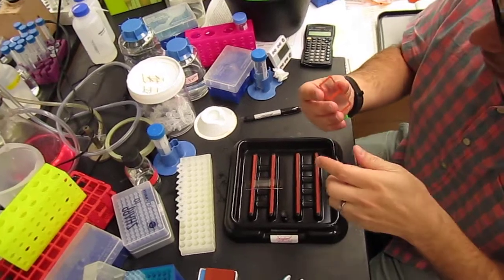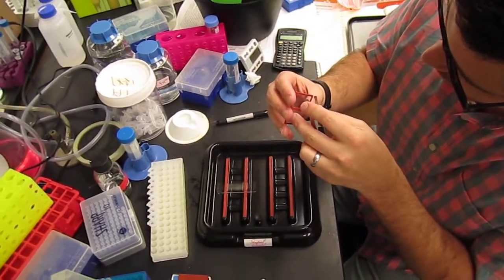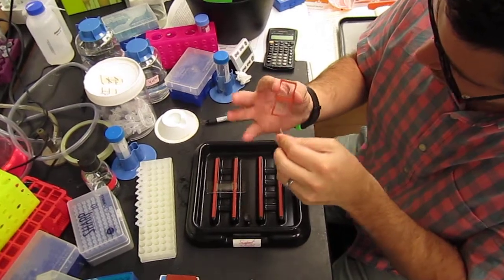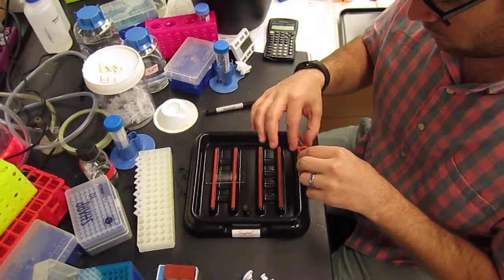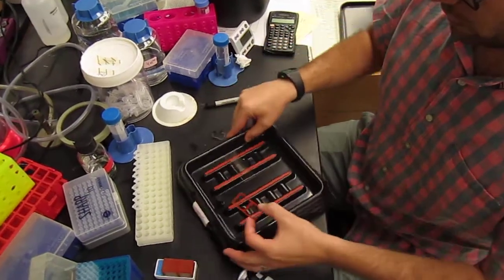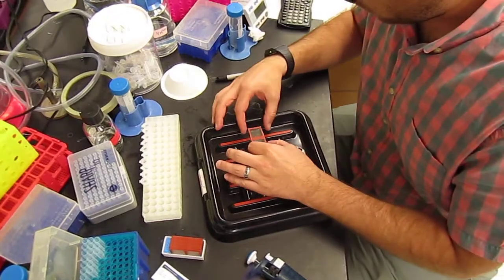We're going to remove the backing from the gasket. We're going to line the gasket with the top of our slide.